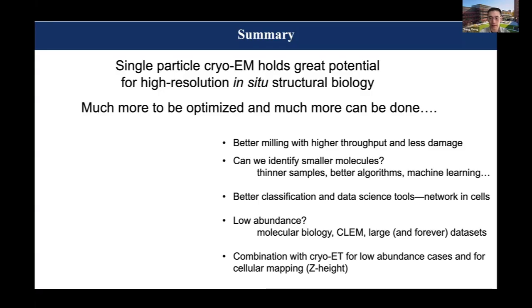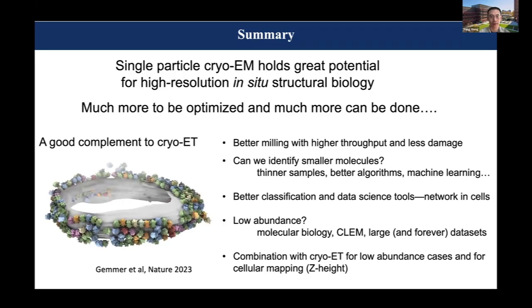Like the third dimension: single particle can define the XY direction very well, but the Z height is very poor, refined by CTF, with large errors. So ET will solve that problem and also give us the entire picture of the environment of the cell. ET gives you the picture of the forest, then hopefully combined with single particle, we can get some details of the trees.